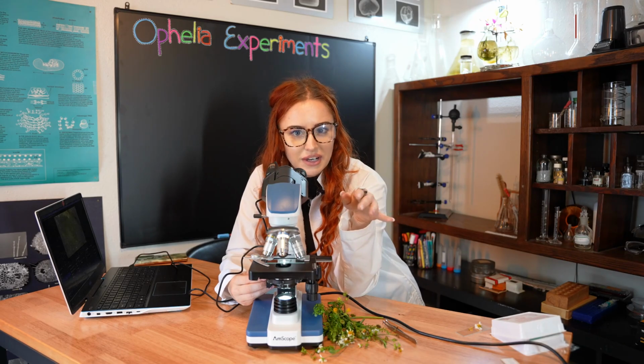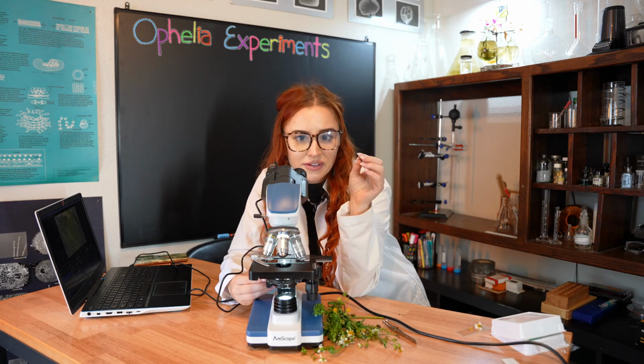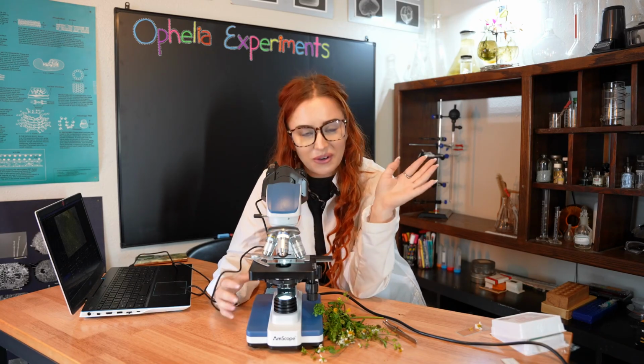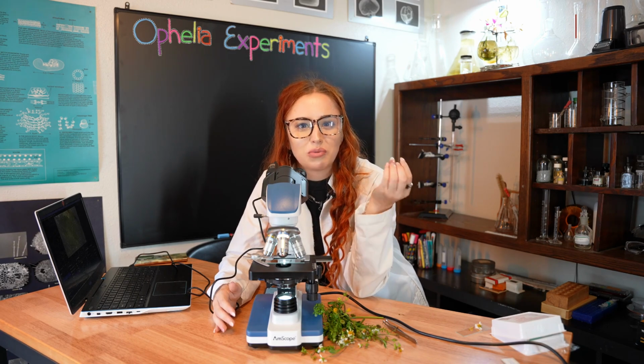And so the next thing we're going to be taking a look at today are the vascular bundles of the flower petal. So if we look through here and try and get it into focus, there it is. This is the plant's transportation system, giving it all its water and nutrients to help it grow.